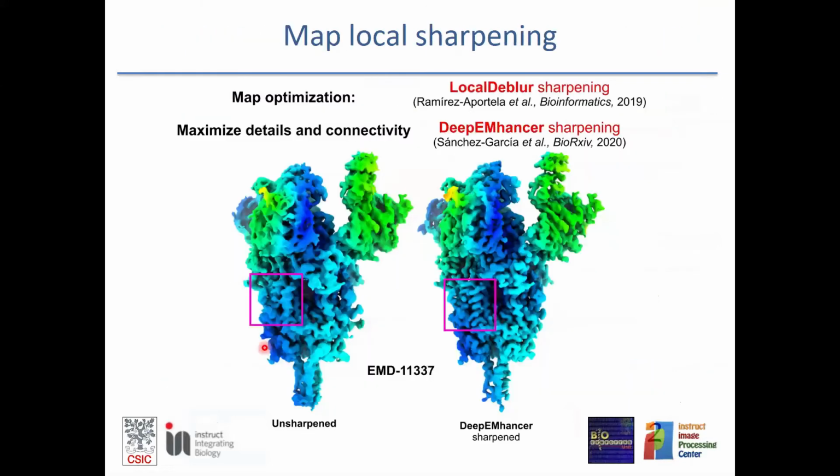We work with the two of them at the same time while modeling, and there is not a way to know in which areas things are going to be better with one or the other. So we normally consider the sharpening as an enhanced view, not as a final result, but an enhanced view for modeling. And we use everything we can. But Marta, you did it hands-on, so.